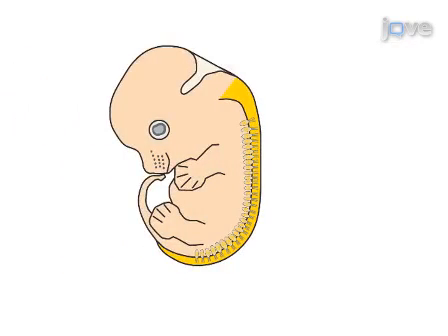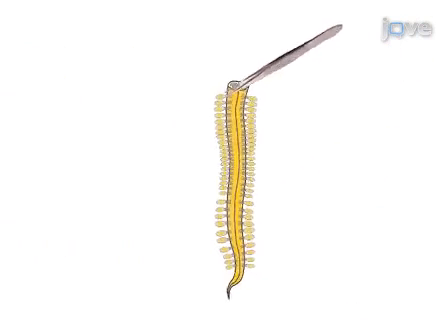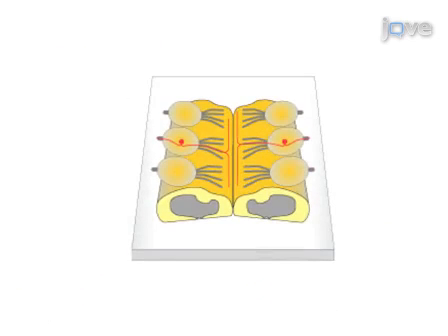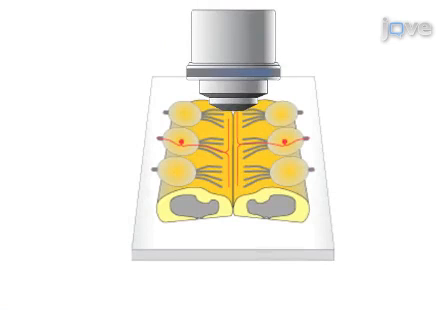This video demonstrates first how to dissect the spinal cord with its attached DRG from an embryonic day 12.5 mouse. Following fixation of the specimen, minute amounts of DiI are applied to the DRG using glass needles pulled from capillary tubes. After an incubation step, the labelled spinal cord is mounted as an inverted open book preparation to analyse individual axons using fluorescence microscopy.